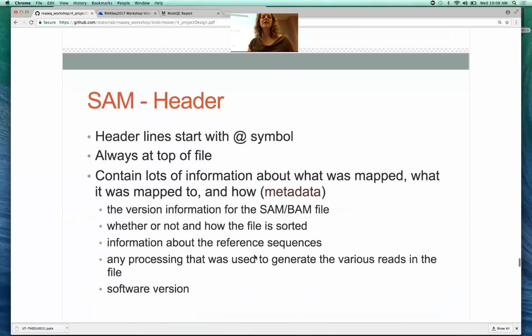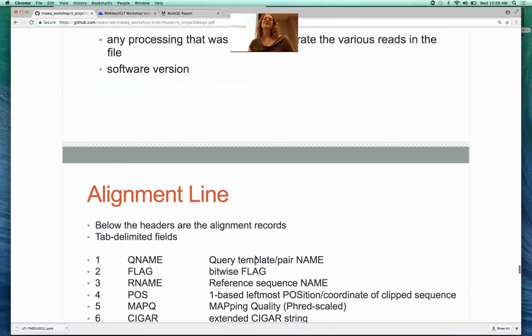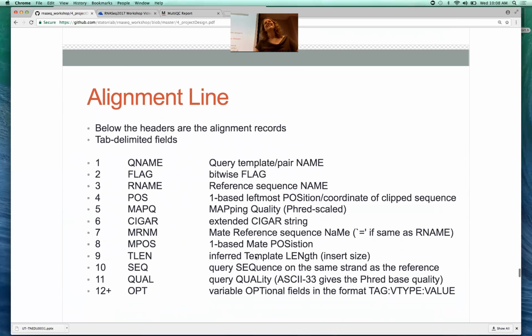Oh no, the reads are going to be millions and millions of lines if you have millions and millions of sequences. Oh yeah, the header can be tens of thousands of lines. It actually ends up, so like the chestnut genome has 40,000 scaffolds. It puts a line for every scaffold to say, this is a list of all the scaffolds that we used for mapping. And so that's just like 40,000 lines right there. They get added to the header. These files are huge, especially if you have big data sets.